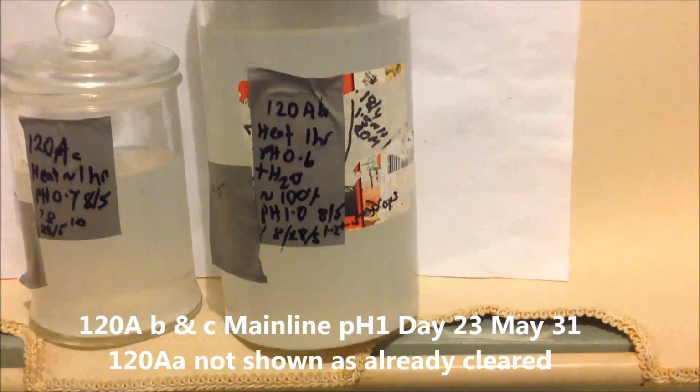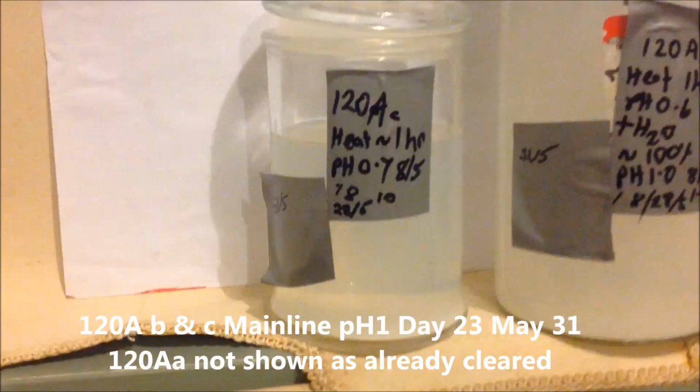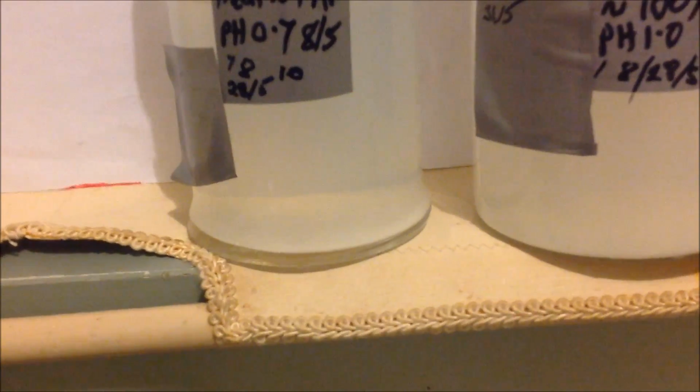120A is very clear. 31st of the 5th, been sitting for 3 weeks now, just over. 8th of the 5th to 31st. 120AC seems to be still clearing. You can quite clearly see the precipitate in the bottom, and also the line of the paper across the back there. The larger one not so, because you can't see the precipitate clearly on the bottom, even in the foreground.